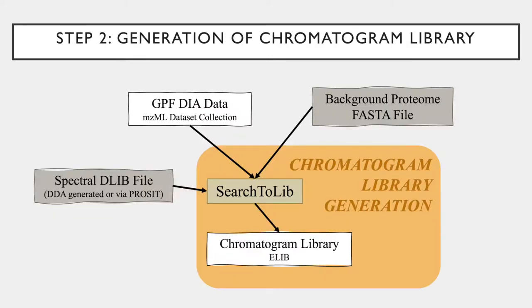The next step is the generation of the chromatogram library using the Search2LIB tool. The chromatogram library is generated using the background FASTA file, the DLIB library, and the .mzml GPF dataset collection previously converted by msconvert. The generated chromatogram library in an ELIB format will take the place of the original DLIB library input, and I will discuss the importance of this later on in the tutorial.